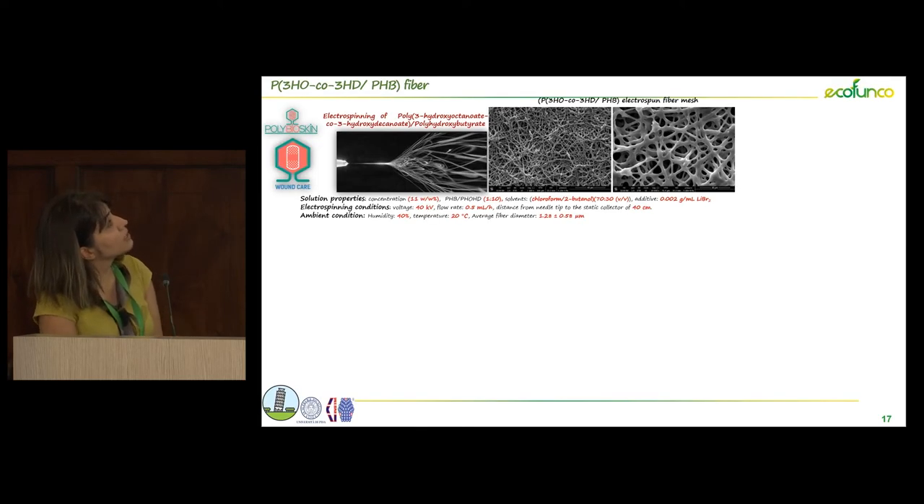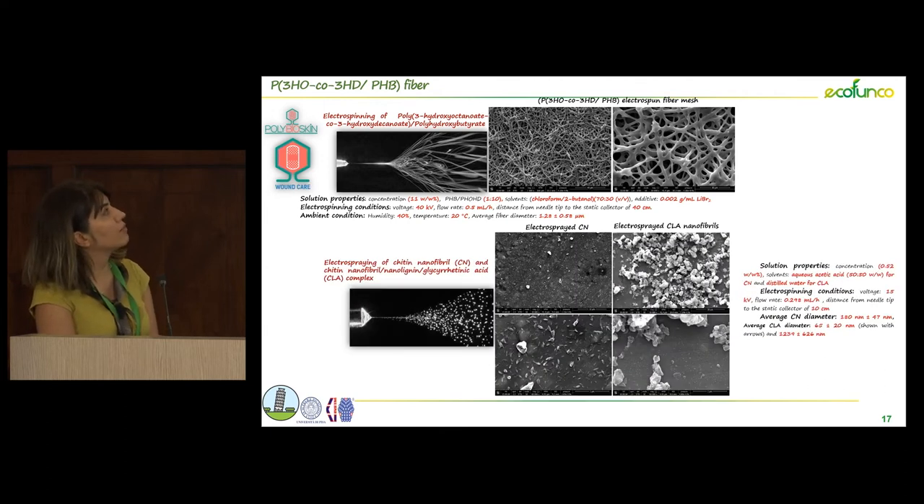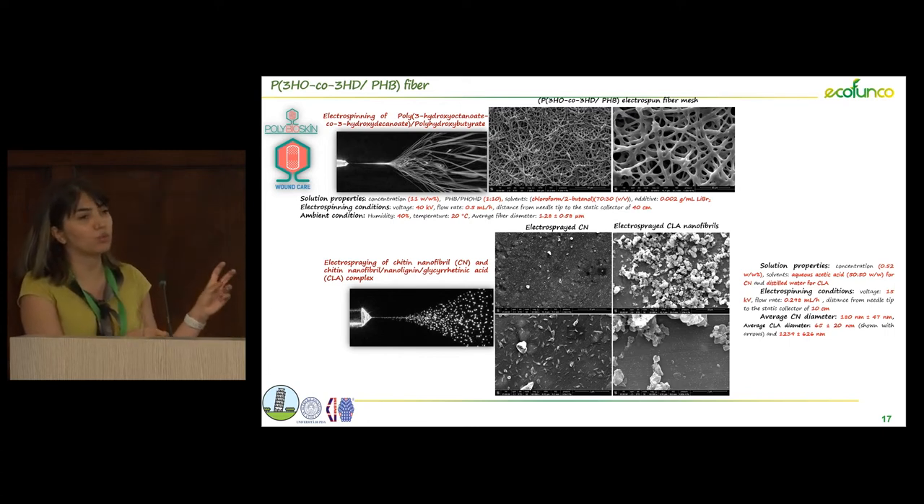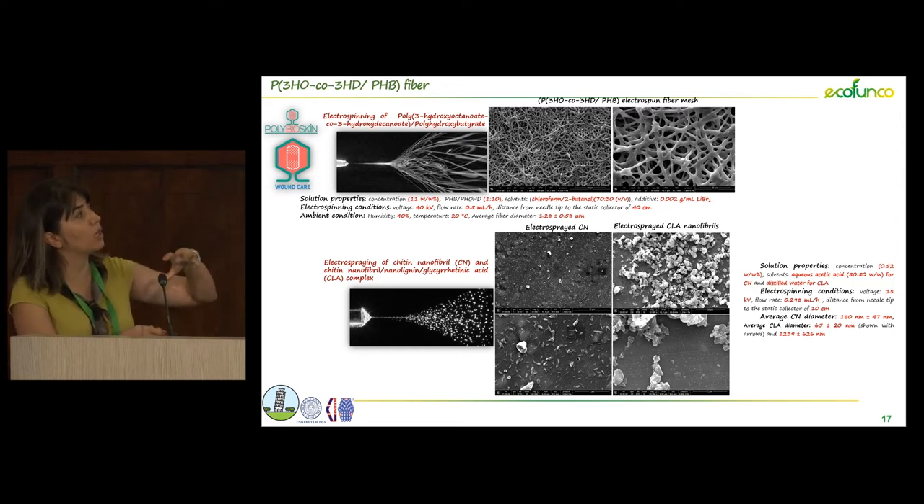Here you can see the PHA fibers we produced with the electrospray system. We tried to deposit chitin nanofibril and also, due to the polarity of chitin and lignin, it is possible to form a complex of chitin and lignin and also include some additives in such a complex. We also tried to electrospray such complexes to compare results. With pure chitin nanofibrils we had smaller size and better distribution, while using these complexes we had some aggregation and two different populations of particles — a bigger one and a smaller one.